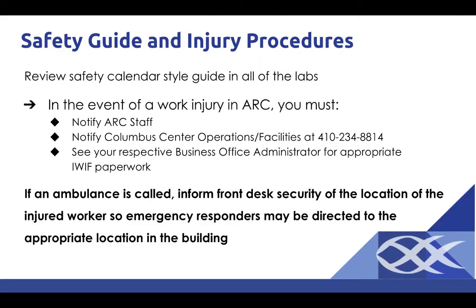There is a safety calendar-style guide in all of the labs that you are working in. It is your responsibility to read through this guide. There is a lot of important information, such as injury protocol and building emergencies. All injuries must be reported immediately to Columbus Center Operations and Facilities at 410-234-8814. Paperwork must be submitted to report the injury to the Injured Workers Insurance Fund, also known as IWIF, and can be obtained from your respective administrative office.